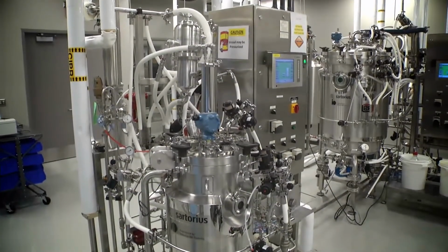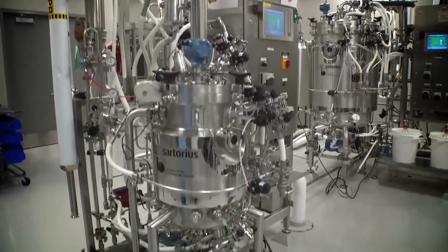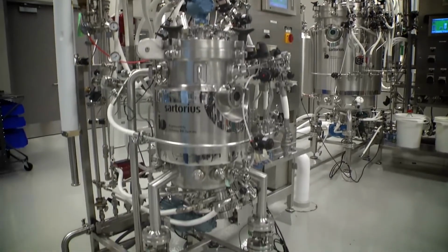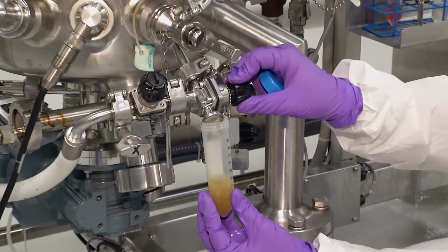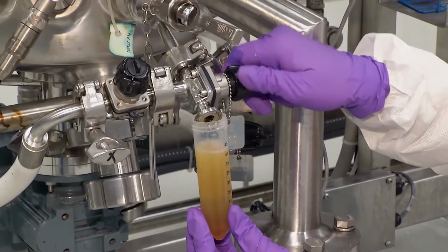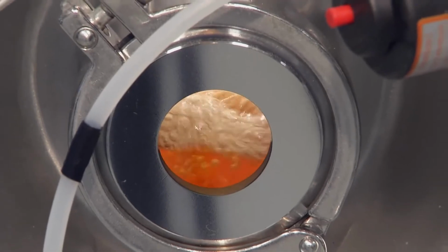After allowing enough time for the cells to produce green fluorescent protein, usually 5 hours more, final readings are taken, and a sample is drawn to check the percentage of cell solids. The product is now referred to as broth.